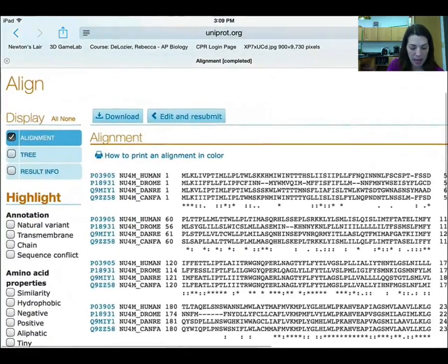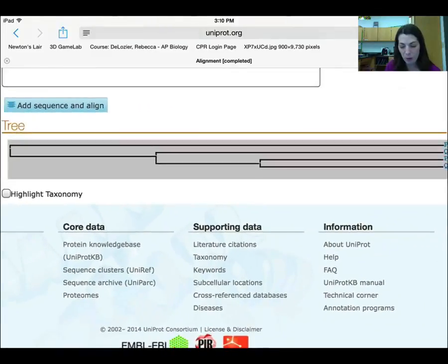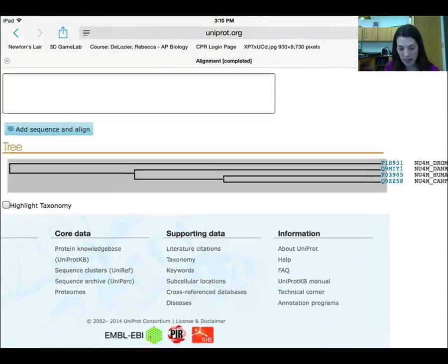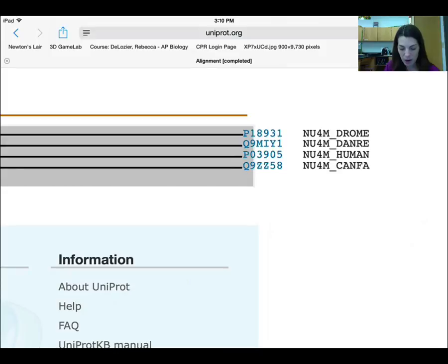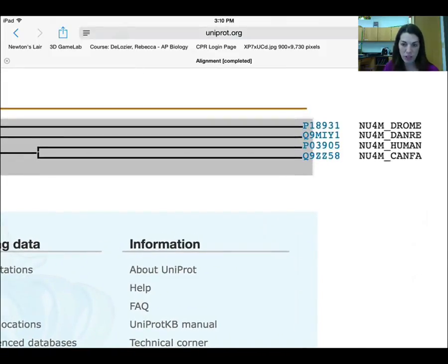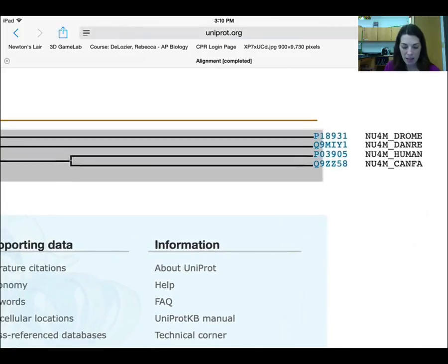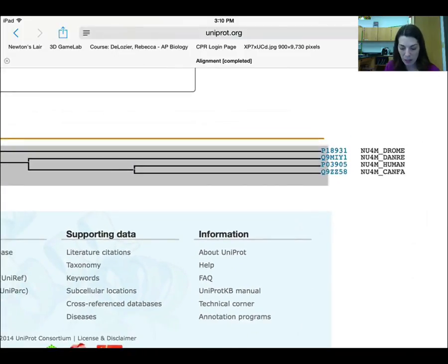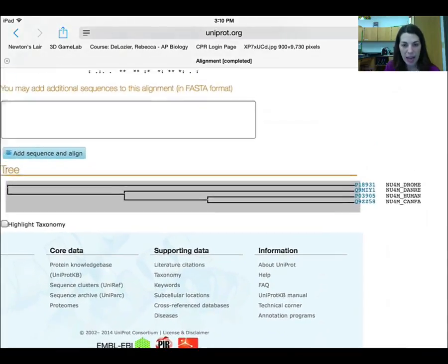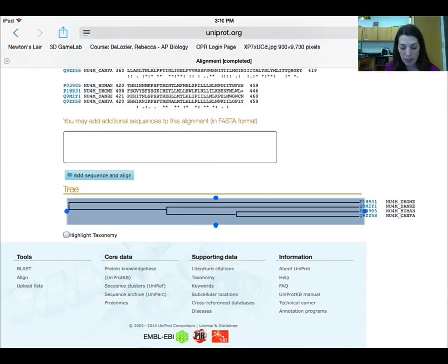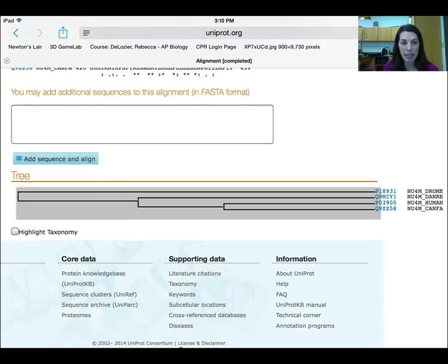Then you're going to look at the tree. The tree tells you how related the organisms are to one another — it shows a branching pattern. The two that are closest together are the human and the canine, which are both mammals, so you'd expect that. Then the next one is Q9MIY1, which is the zebrafish, and P18931 is the Drosophila. When you have the tree, you can long-hold and save it or screenshot it. You do need to write the scientific species name and probably the common name as well.